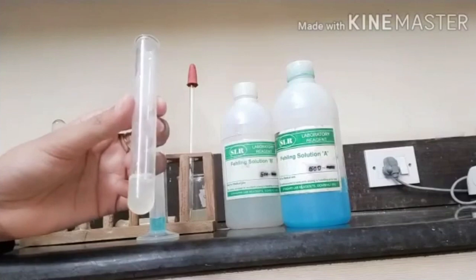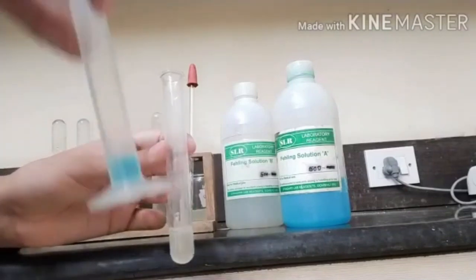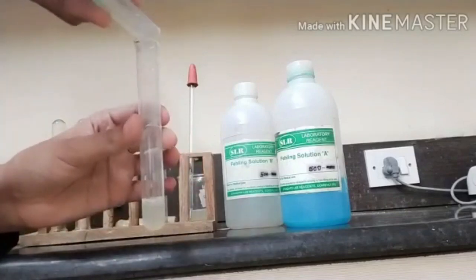After adding unknown sample, we have to add 1 ml of Fehling A solution and pour into the test tube.